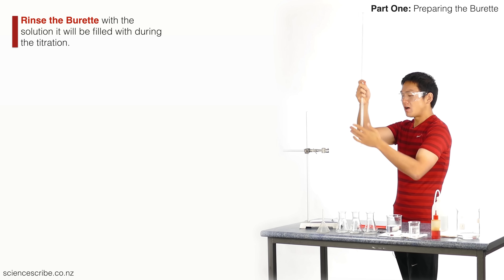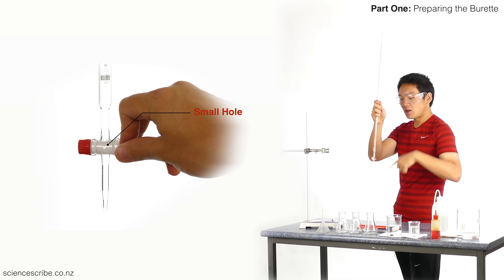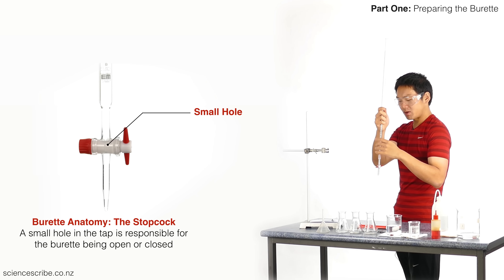I've unclamped it and I'm going to check that my stopcock is in the closed position. When the handles on the stopcock are horizontal, that is the closed position. If it's ever vertical, that's the open position.